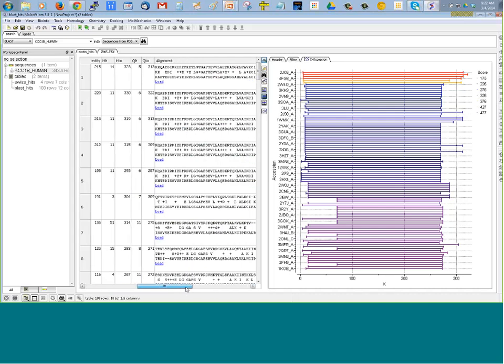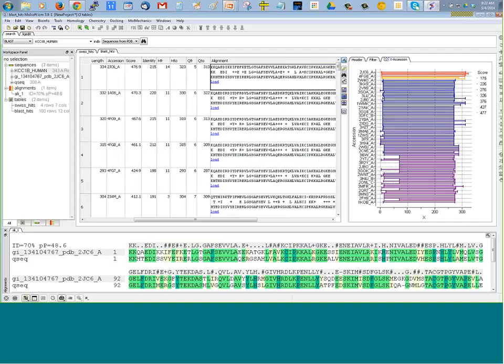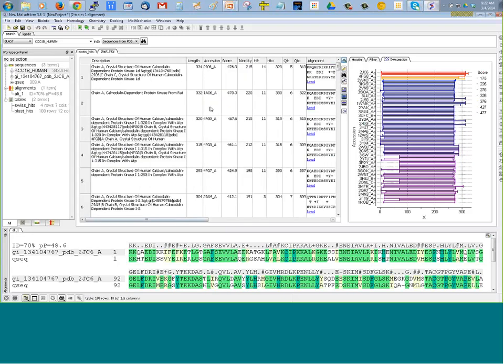So we can, for example, load in the alignment, shown here. That's our query sequence against the hit from the BLAST search. So I'm going to choose one of these. These are all pretty similar, so we can choose some of these to start modeling with. Choose 1A06.